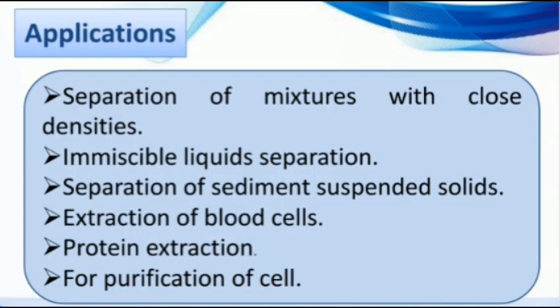If we discuss the applications of centrifugation, although there are vast applications of centrifugation, like it is involved in biopharmaceutical analysis of drugs, in the production of bulk drugs, production of biological products, use in water treatment, and many more. But some basic applications are discussed here, like separation of mixtures with relatively close densities, immiscible liquids which do not form a homogenized mixture, separation of sediment like solid particles, suspended solids, extraction or separation of blood cells, protein extraction, or purification of cells.